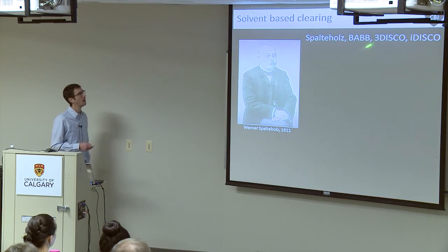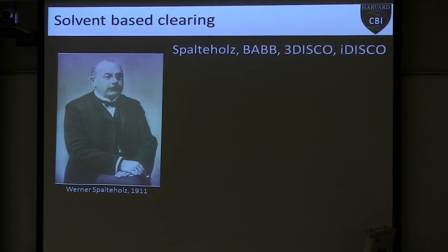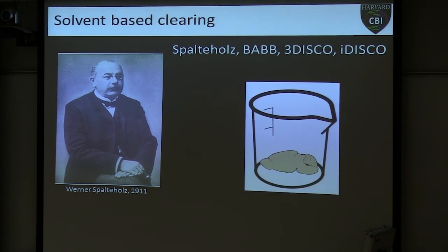Since Spalteholz, there have been a lot of refinements of his technique. We've gone from BABB to 3DISCO to iDISCO, which is now the latest one. And at Neuroscience this year, they presented uDISCO, which was ultimate DISCO, and iDISCO+. So like I said, this changes monthly. But the concept behind all of these is essentially the same.